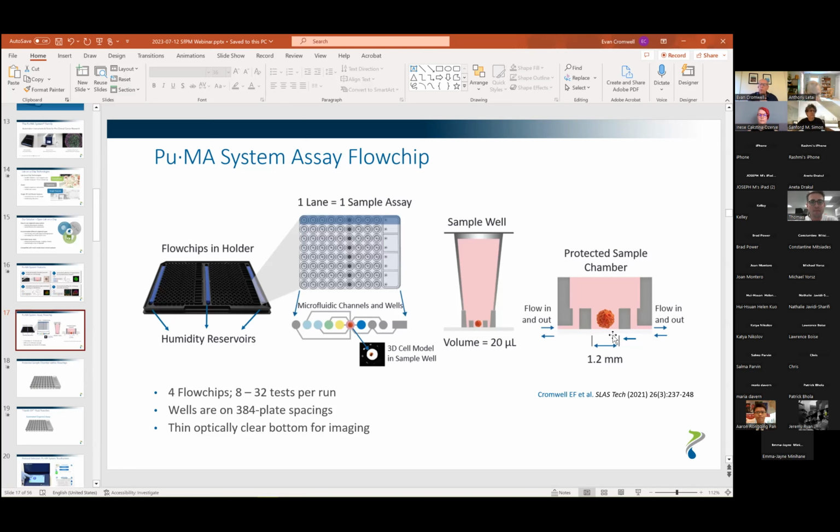We've grown organoids in this area, and then subjected them to different treatments. You can flow immune cells in there, and the immune cells will work their way through the hydrogels. So there's a lot of different ways you can use this. But bottom line is, yes, we can do hydrogels. We've done different organoids using hydrogels very successfully.